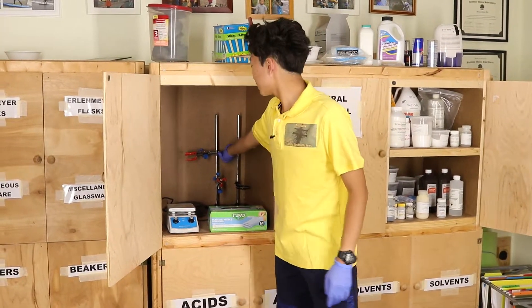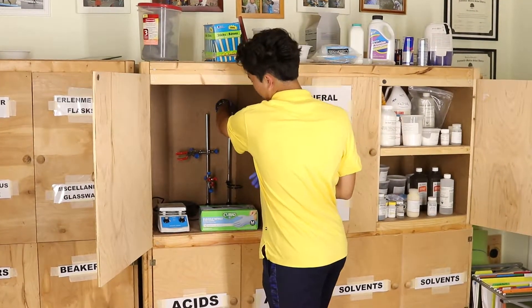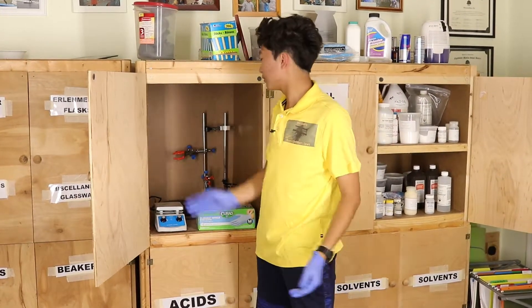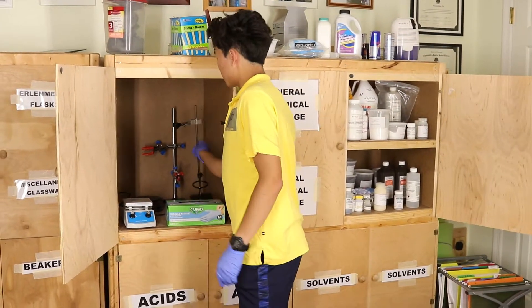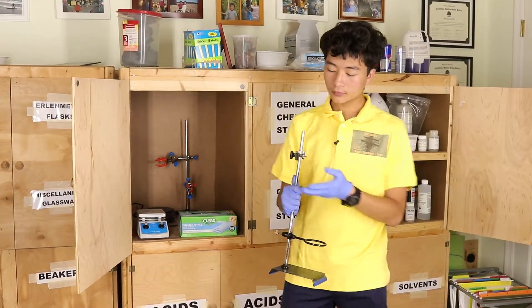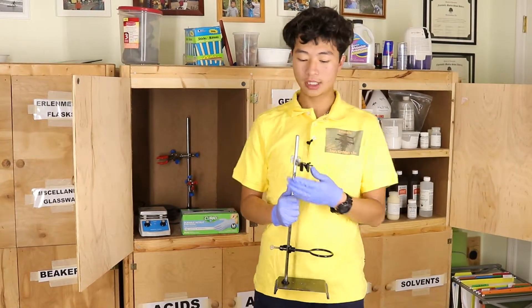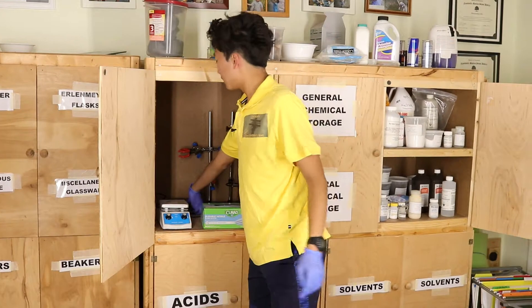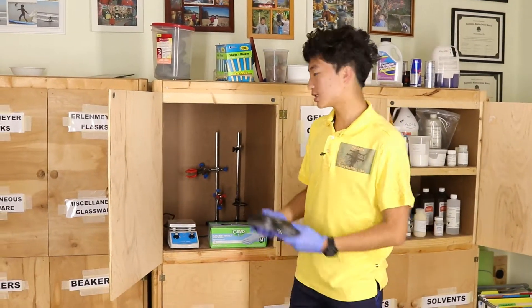I have ring stands — basically plug-and-play. You have little clamps with a fitting that you slide in, tighten, and it stays in place. I have standard claw fittings, useful for test tubes and really anything. This ring stand is useful for separatory funnels and for heating things. I also have a more specialized clamp for burettes and test tubes. And of course every lab must have a scale — we measure things in grams, not teaspoons and cups.